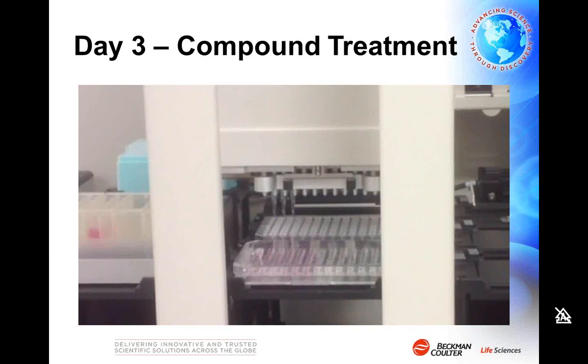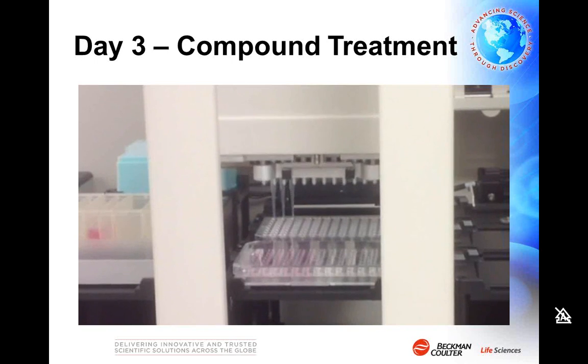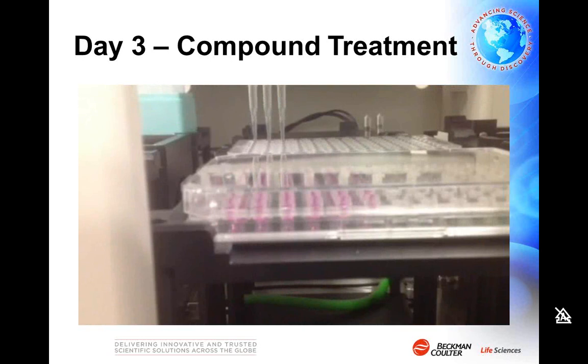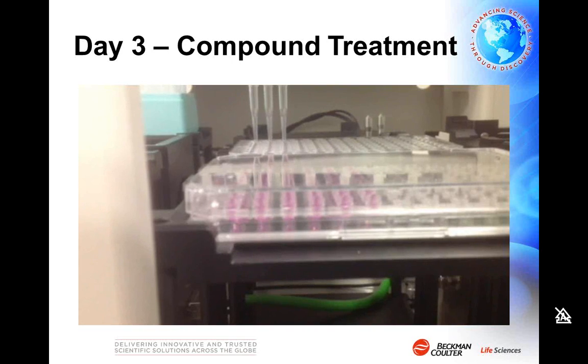Moving row-wise is something that's not necessarily easily done with a span 8 pipettor or fixed 8 pipettor. So what you can see here is aspirating the compound, moving 1 row further up, dispensing and mixing, and then aspirating that well and moving to the next row, again for part of the serial dilution.